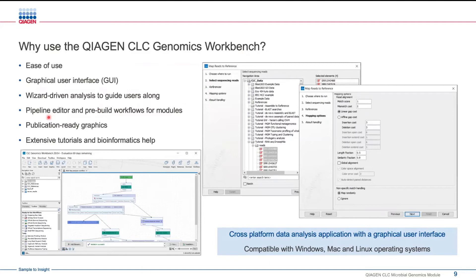There's a pipeline editor — we refer to them as workflows, and you can use the words pipeline and workflow synonymously. We're going to be using prebuilt workflows that come with the MGM module. However, those workflows are editable, so you can use them as a building block, or you can build your own workflows from scratch. I already pointed out publication-ready graphics, and there's also an extensive library of tutorials, bioinformatics help, and customer support available.